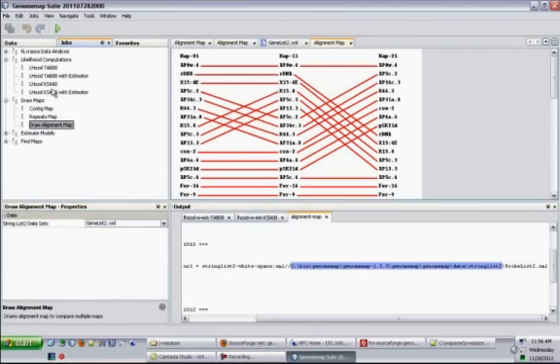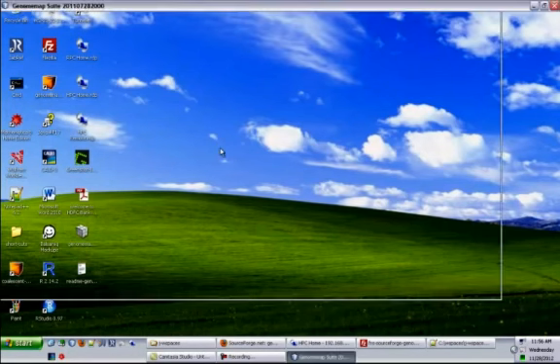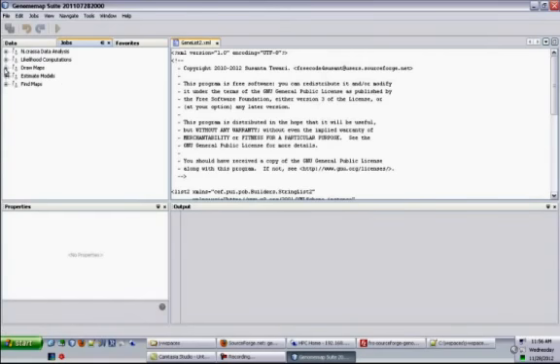Now for common datasets, we can reuse that data for all the different jobs that are applicable. So let's restart. And you can see here the new dataset that was added.